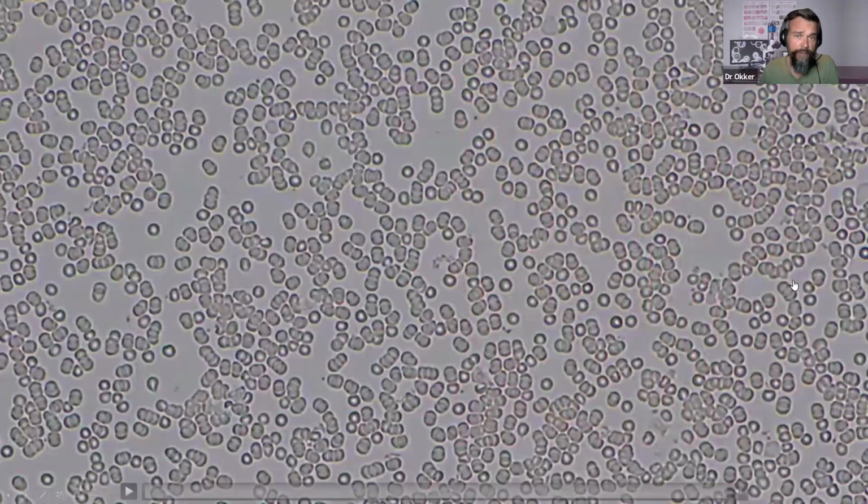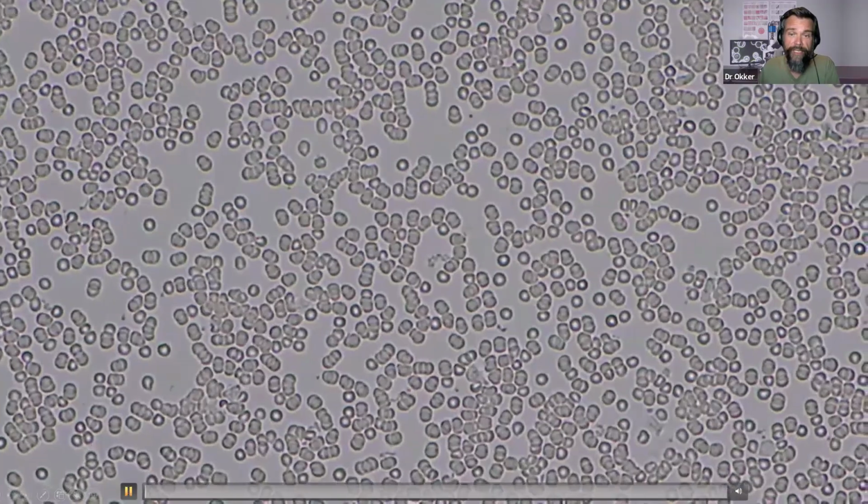So we actually have an example here of a live and dry blood sample from an actual client, and we can go through the anomalies here and the findings, and you can actually see the type of patterns that we look for in a live and dry blood sample. So we'll start off with this. As we can see on the screen there, we're actually looking at the blood cells here at a very low level of magnification, just to give an idea of what the sample looks like when it's kind of zoomed out, and then we'll go into higher magnification right away.